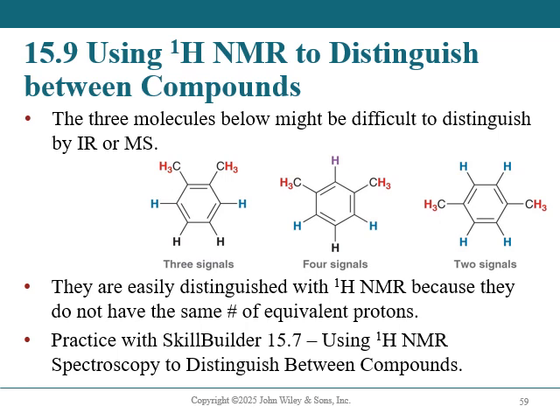In this case, this signal is going to be different than this one. So you have 1, 2, 3, 4 signals. And then here, these 4 protons are actually similar. So you should expect just the 1 signal and then a second signal here. So these are all things we can do with NMR. That's why it's so important that we familiarize ourselves with it. That's why organic chemists really like it, because it's actually much more powerful than infrared or MS.